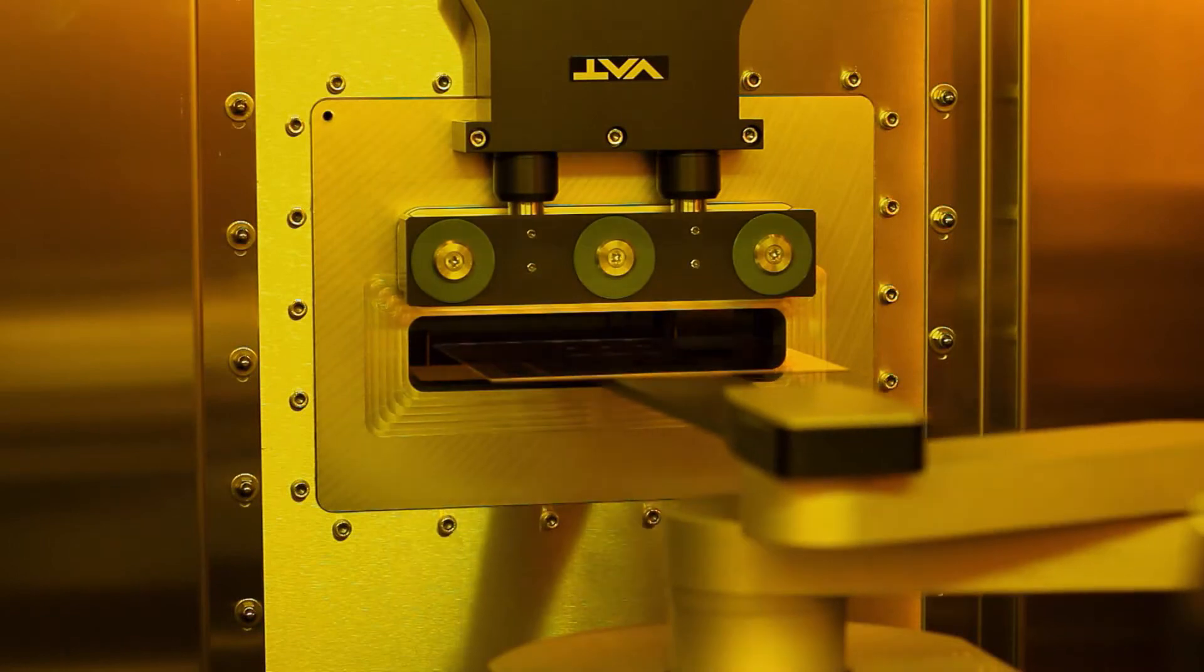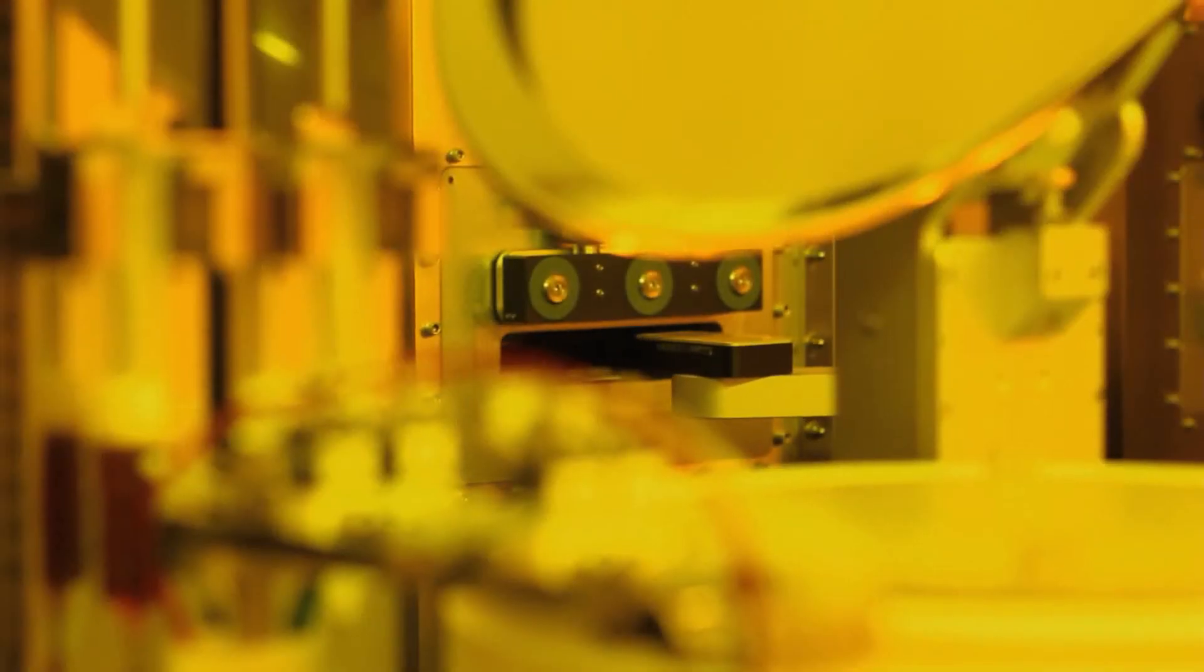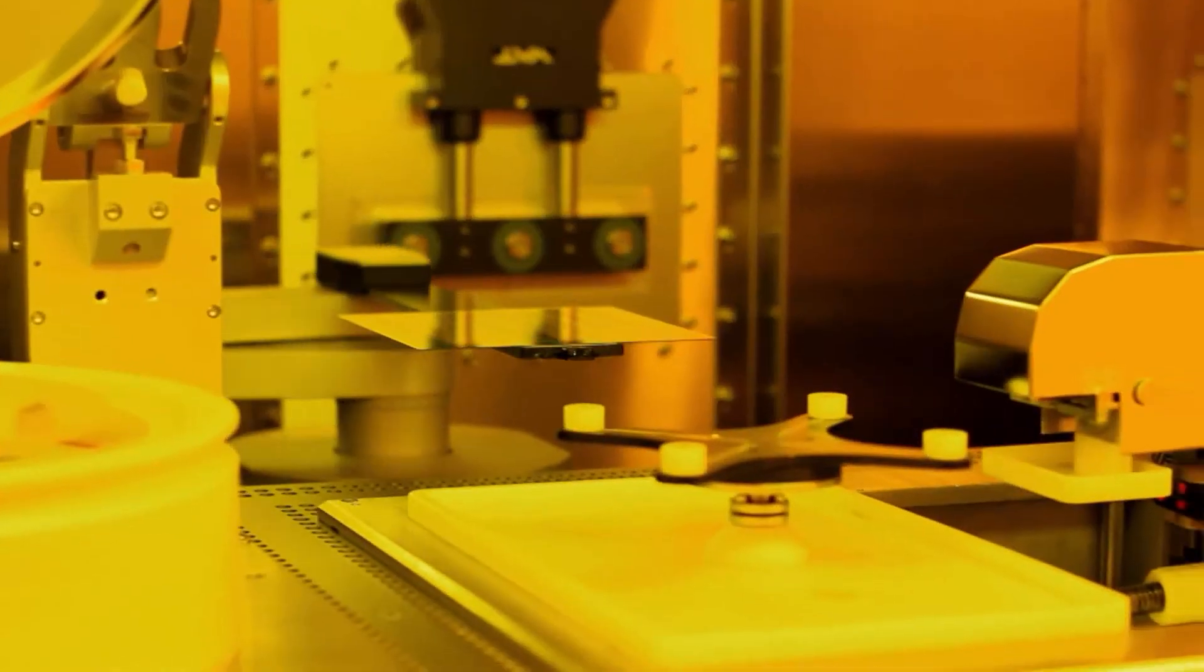Hot plate vacuum ovens provide a controlled temperature bake with a range of process conditions to ensure optimum uniformity of the dried film following coating.